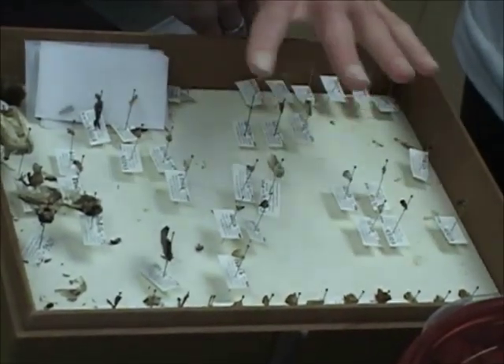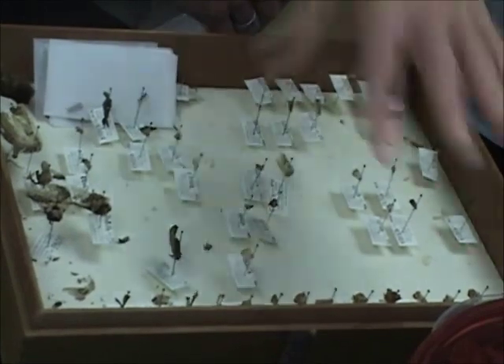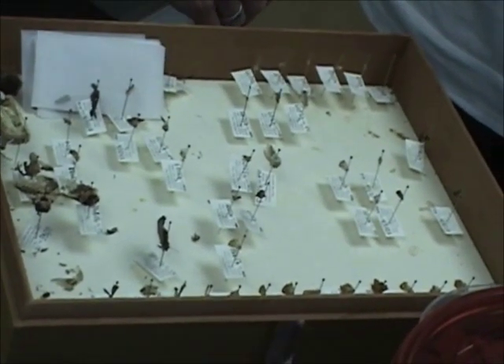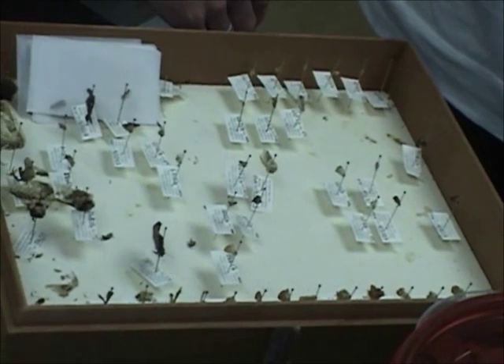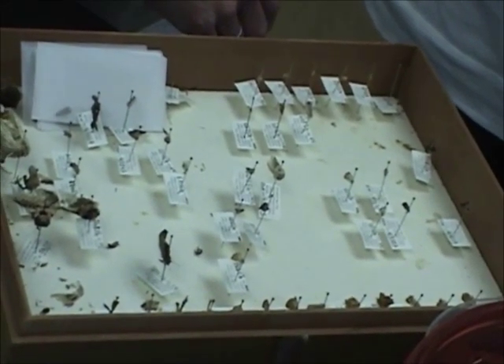They get shipped back like this, so they're not frozen. These just go straight into the whole thing for relaxing. Then some of them obviously go better than others when you try to spread them. These guys are already two years old, which is not ideal for pinning.